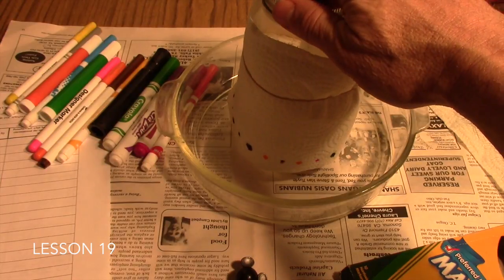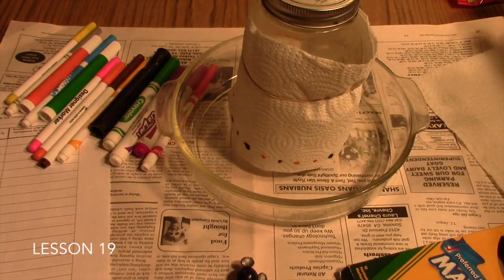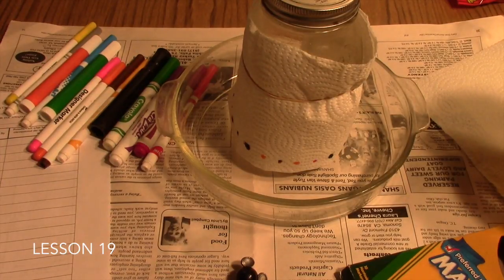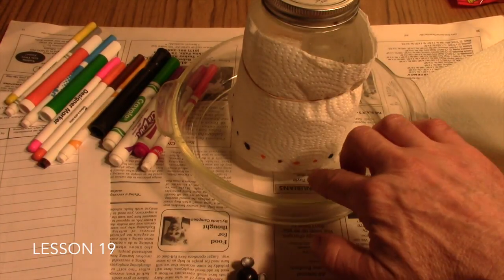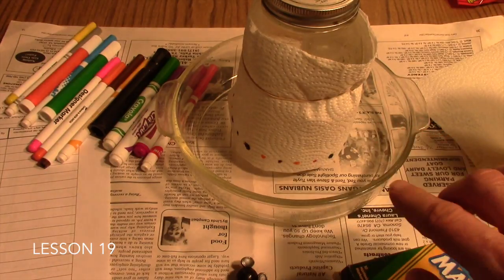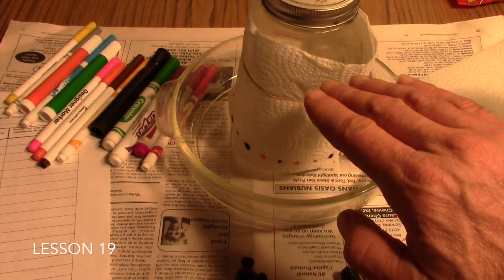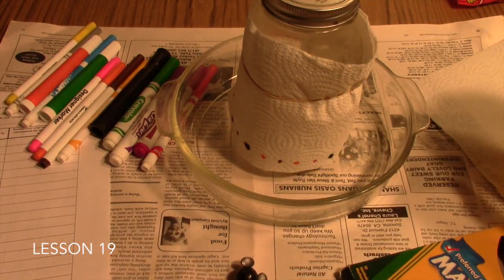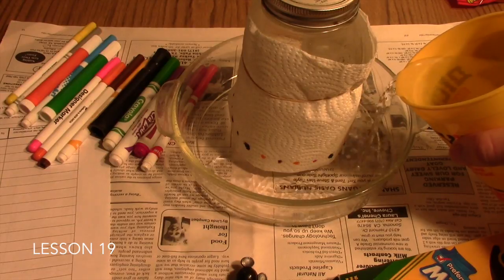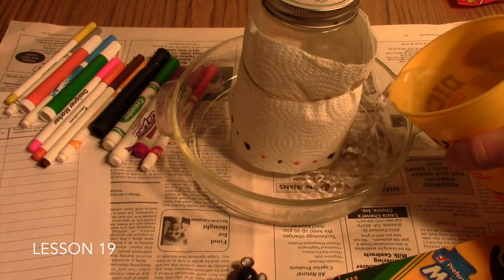I'm going to set it in my dish, and then I'm just going to take some water and pour it into the dish. Now remember that we only want the water to come up to the bottom edge of the paper towel, and as the water gets drawn up into the paper towel, we may actually have to add more water to the dish. So I'm going to go ahead and pour in the water.